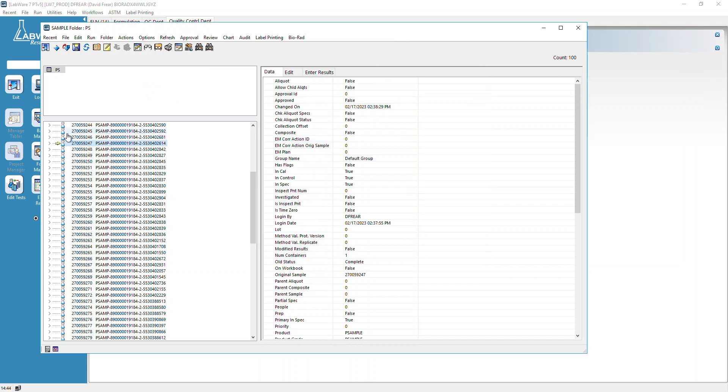We'll come back and look at our samples and review them. I'm not at that stage yet, so we'll do a sample review P sample review recording later. That gets us loaded up and we're ready to run. Thanks a lot everybody, talk to you later.